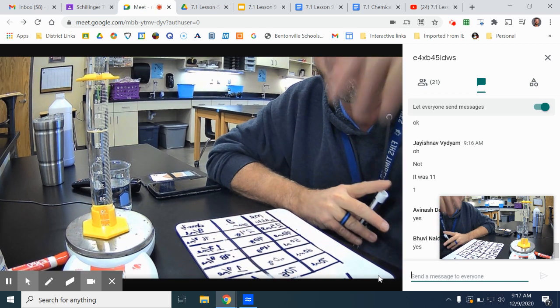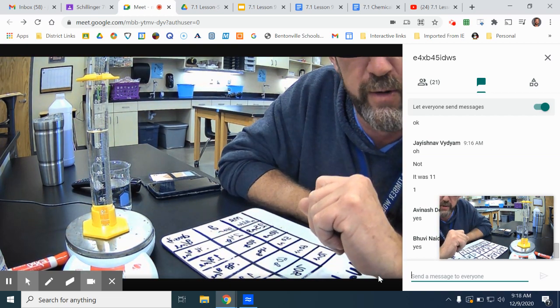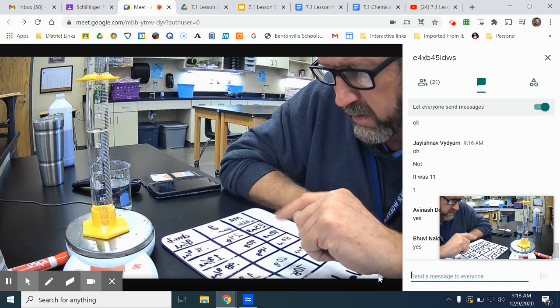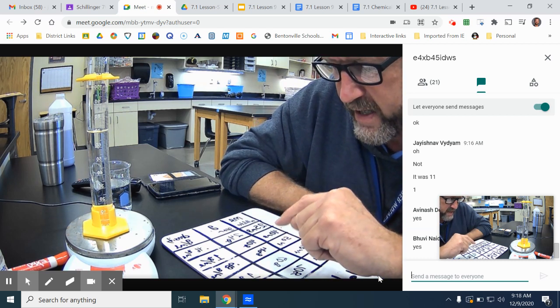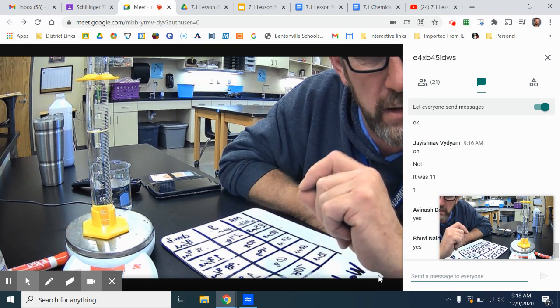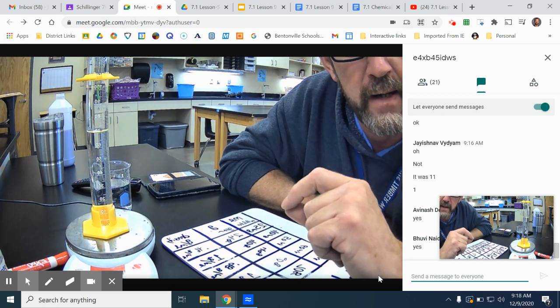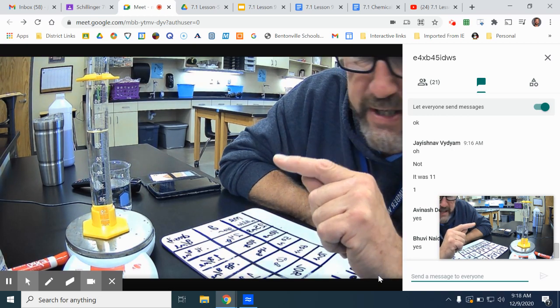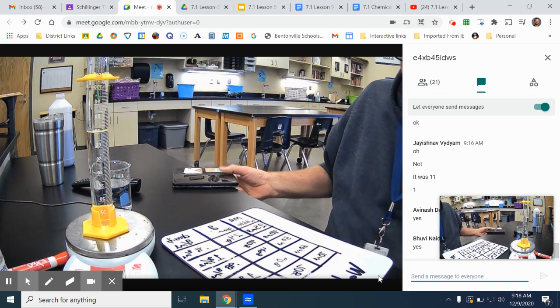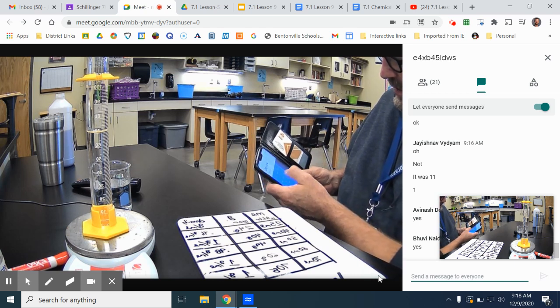And the other thing is my scale only reads whole numbers. So it's very possible the 24 or the 49 was 24.9999999, just hair off. But again, that's human error. That's me not having the precise amount on there. If I were to add all these up, what is my average for the 5 of those? So let's see here.